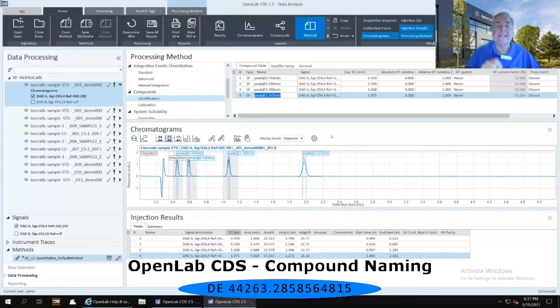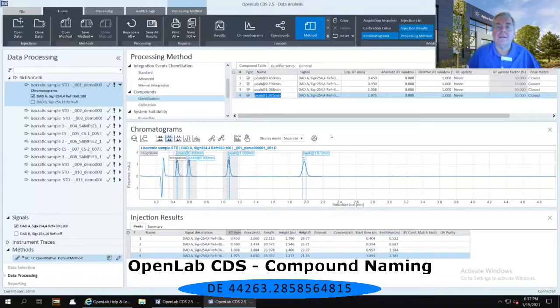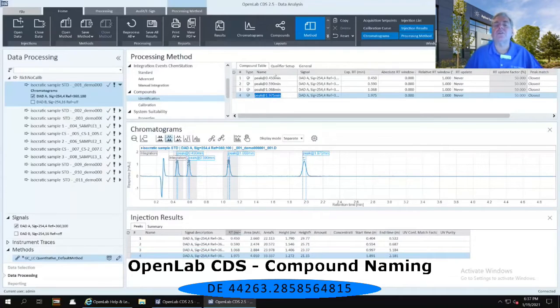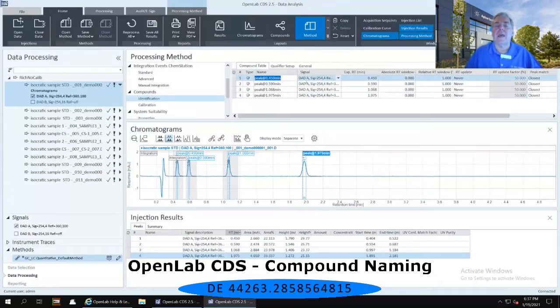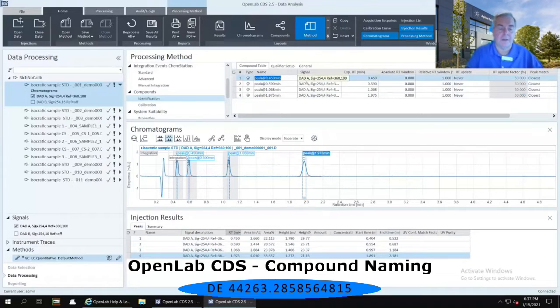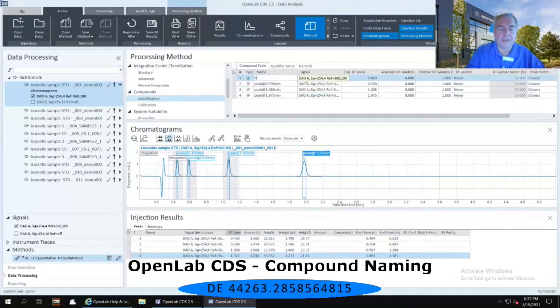Maybe that's not the name I would like. So instead, I can click on the first named peak and I can type in the name I want to give it. I'm going to give mine Rich-1peak.